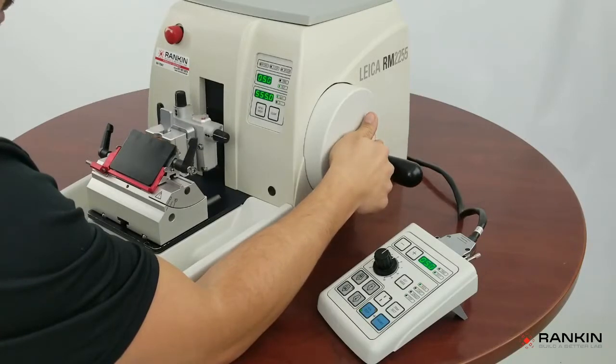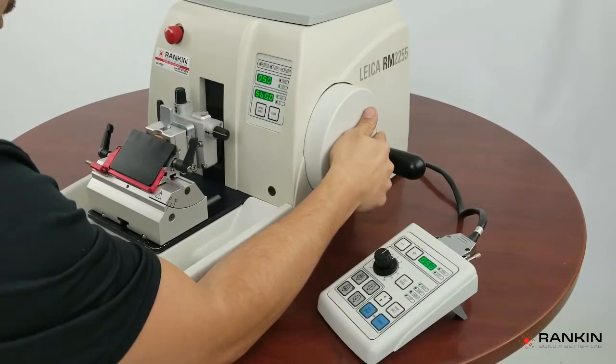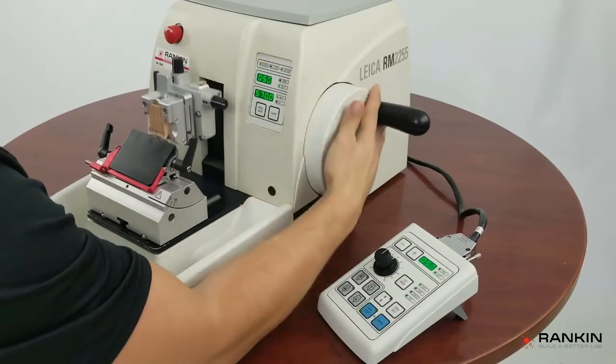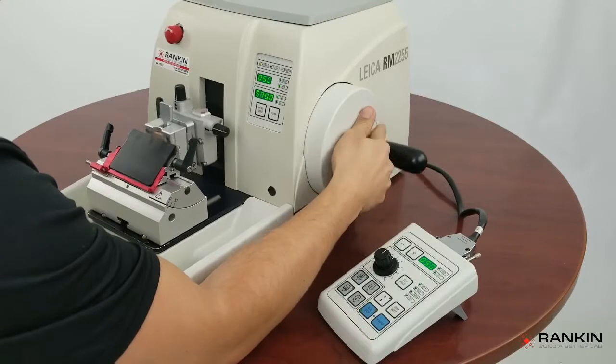You have to be careful with this mode because if you don't come all the way through the specimen and you decide to come back, it will retract. But on the way down, you may damage your specimen. So you want to make sure that every time you rock, you come all the way through the specimen and then come back up.